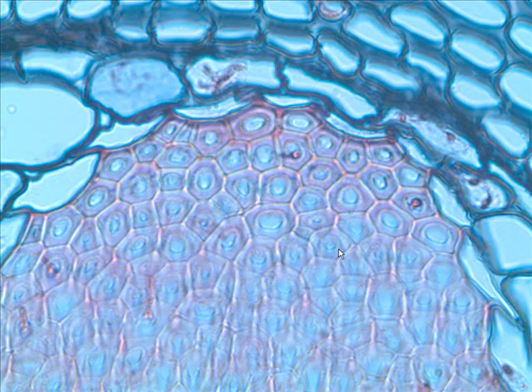So here we are up close and personal at the top of the vascular bundle. What is this again? What tissue is this? Kind of forms a little cap. It is sclerenchyma. Sclerenchyma fibers. What do we say about fibers in class? They are hollow, thick-walled cells. Does this opening here connect to the outside world? No, it does not.